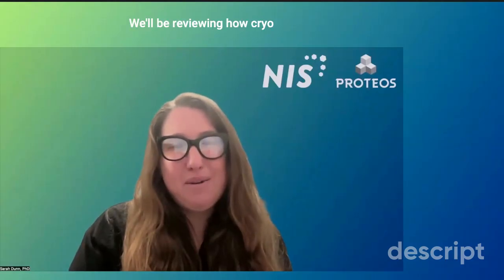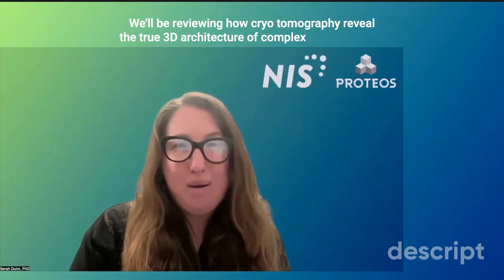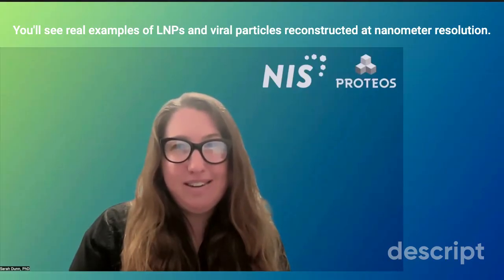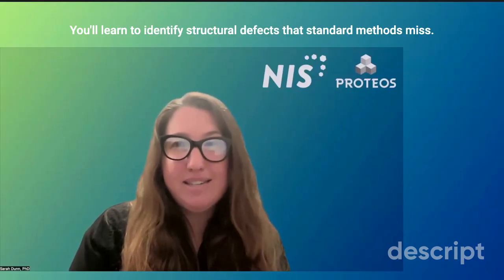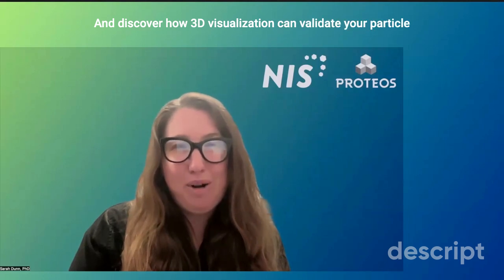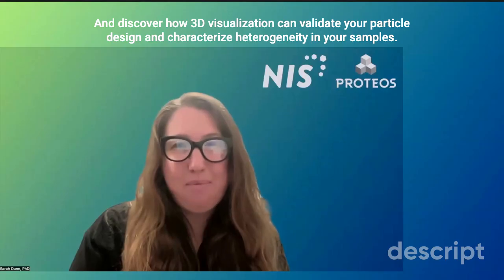We'll be reviewing how cryotomography revealed the true 3D architecture of complex nanoparticles. You'll see real examples of LNPs and viral particles reconstructed at nanometer resolution. You'll learn to identify structural defects that standard methods miss and discover how 3D visualization can validate your particle design and characterize heterogeneity in your samples.